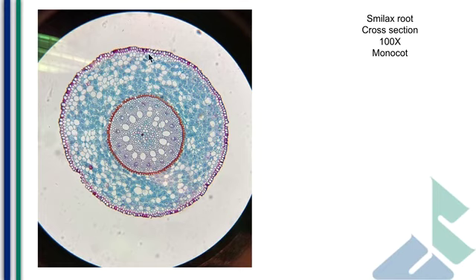You should also note the epidermis as well as an exodermis, a tissue layer on the outside of the epidermis providing a very thick, in this case, much more woody, even though it does not have wood growth, a much thicker outer layer on this greenbrier or smilax.